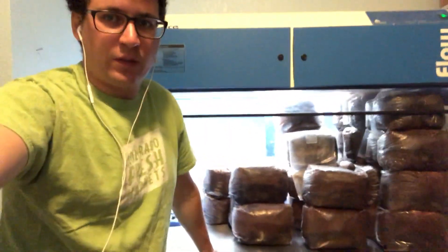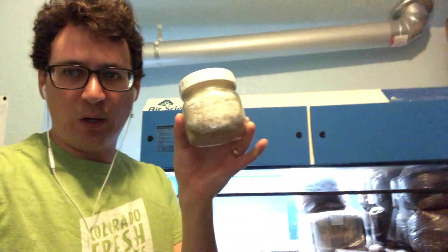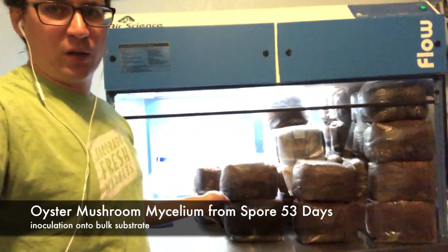What's up guys, it's Gary with Fresh from the Farm Fungi. I'm here in my lab in Denver, Colorado, and it's a very exciting day. I've got my front runners that I've been breeding since February 17th — that's 53 days from spore until inoculating bulk substrate, which is very fast, pretty much on par or better with my king oysters. I've got about nine different phenotypes that I'm going to be inoculating.